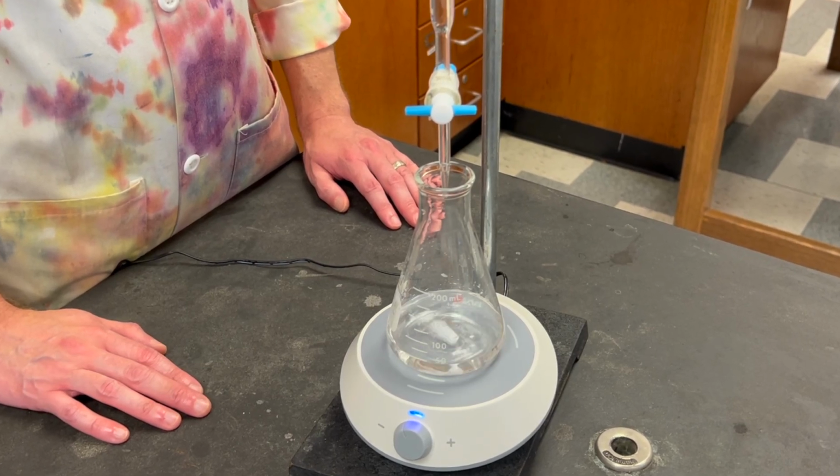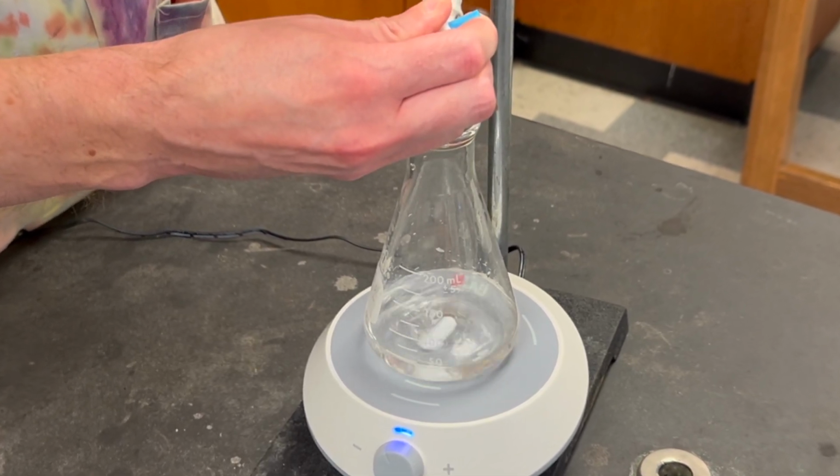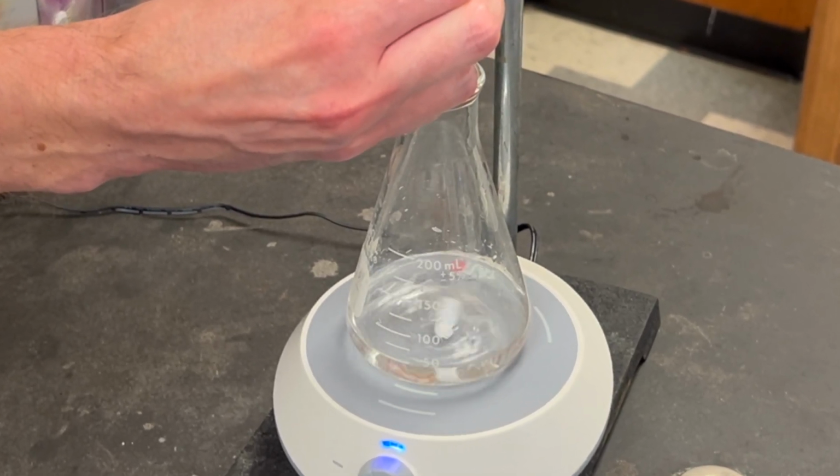Slowly add the NaOH to the vinegar in the flask until a pale but permanent pink color is produced.